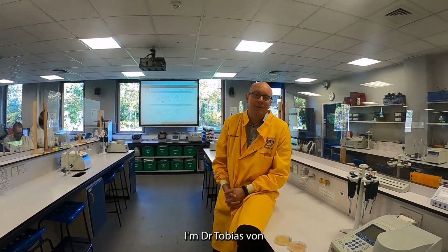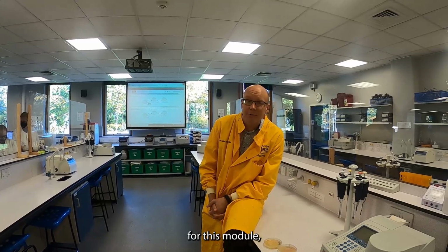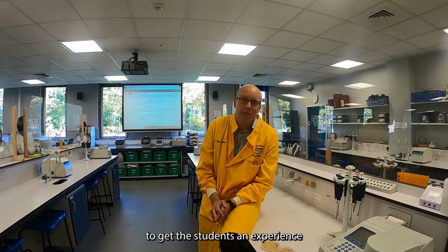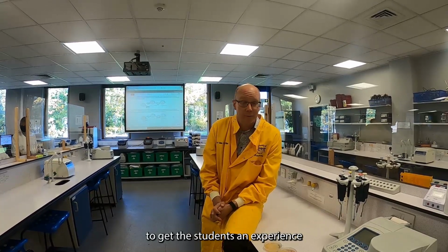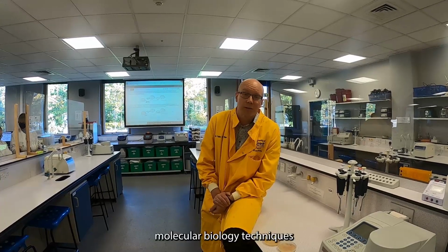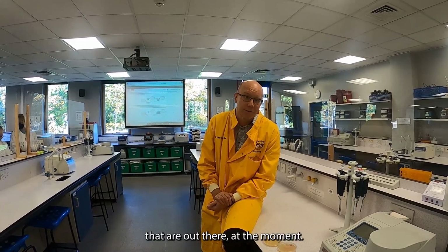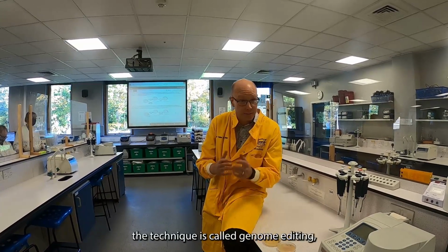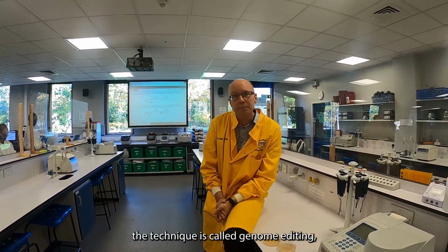So I'm Tobias and I'm the module convener for this module. And we designed this module basically to give the students an experience in one of the really most cutting-edge molecular biology techniques that are out there at the moment. And so the idea is, the technique is called genome editing.